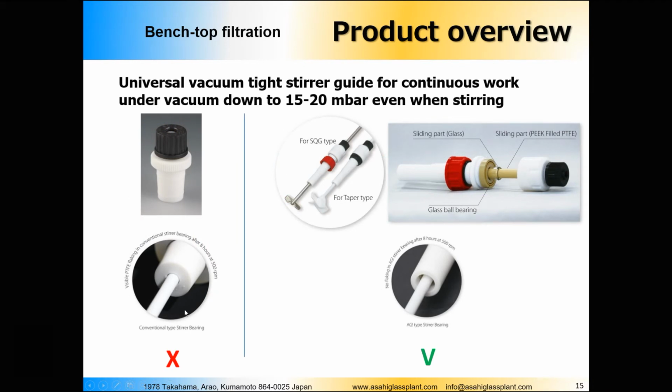So on the left side of the slide you can see a relatively standard stirrer guide that many of the manufacturers of the reactors offer.